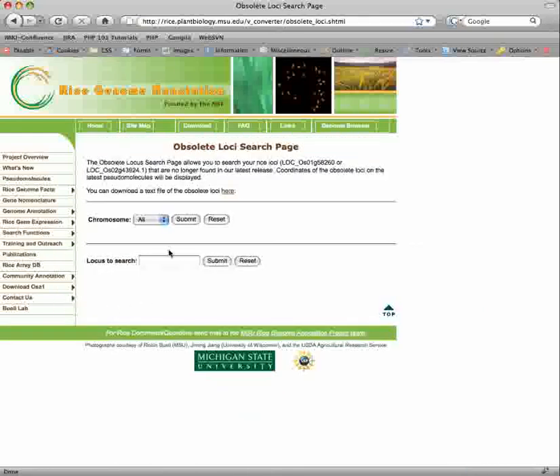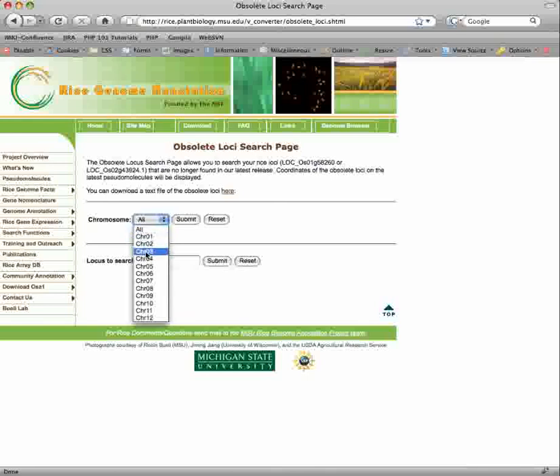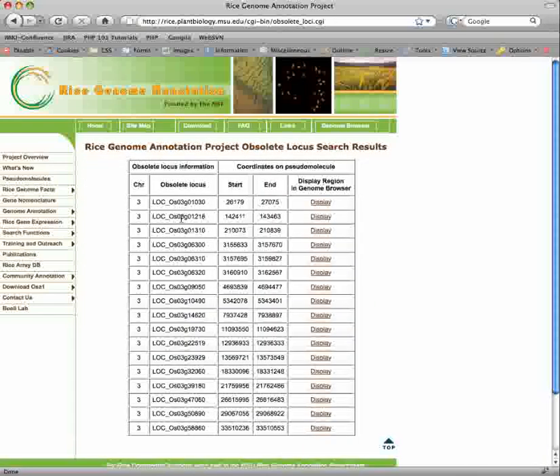Some loci are deprecated and are no longer in our current annotation and are thus obsolete. You can get a full listing of obsolete loci on a per chromosome basis by using the radio buttons and selecting submit. The chromosome, locus ID, and coordinates on the pseudomolecule are all listed. A link to the region in the genome browser is provided.